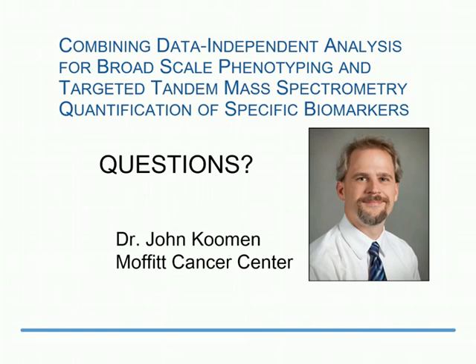All right, next question. Is peptide enrichment necessary for DIA if the modified peptides are low abundance in a complex proteomic sample? I would say definitely yes. If you're interested in modified peptides, the success that we've historically had here at Moffitt with the different collaborations that have used proteomics has always been in enriching modifications. If people are interested in studying kinase signaling, then we definitely want to enrich the phosphopeptides. If people are interested in studying ubiquitination processes, for proteasome inhibitors for example, or for differential degradation studies, then you want to enrich the ubiquitinated sequences. So we always recommend people focus the power of the mass spec on exactly what they want to study.